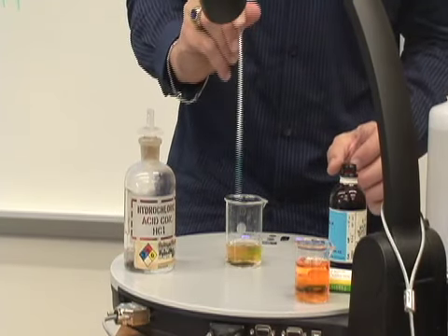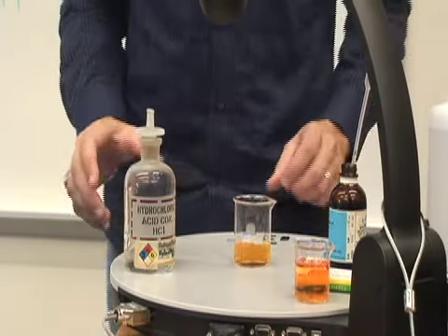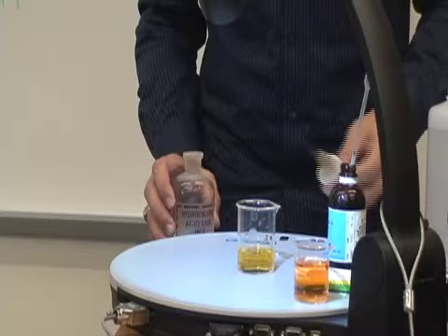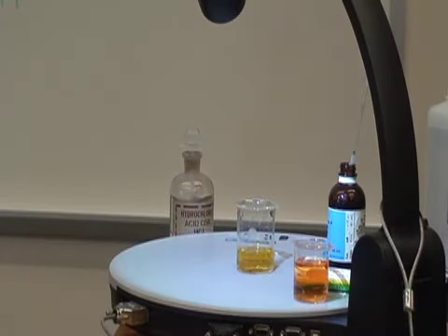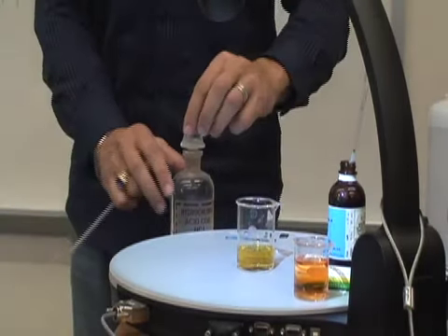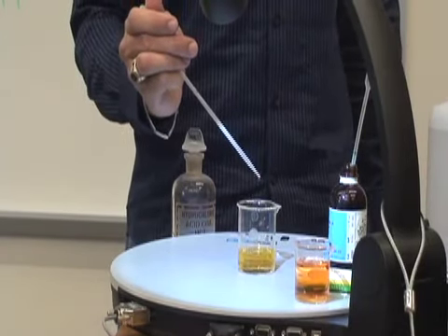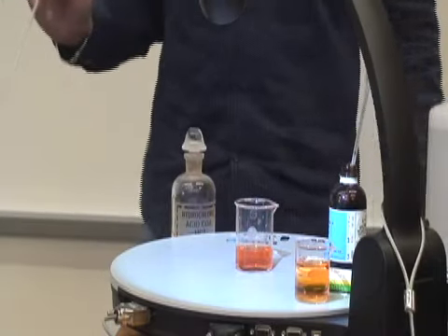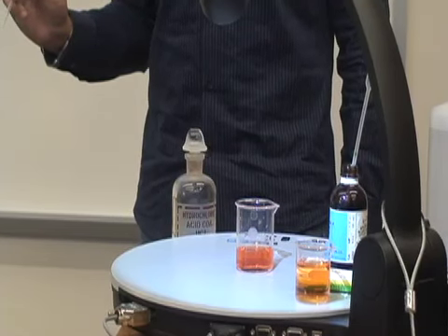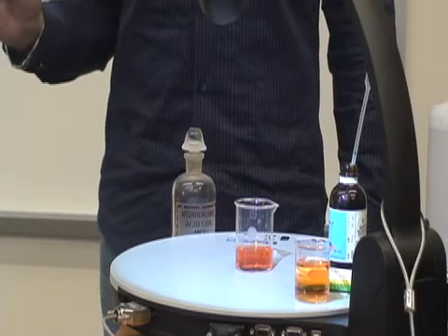Put some indicator on. And we've got what? A neutral solution, right? What do you think is going to happen when I put a drop, 1 drop of hydrochloric acid in here? That's 1 drop of hydrochloric acid. It went from a pH of 7 down to a pH of 3-ish with 1 drop.